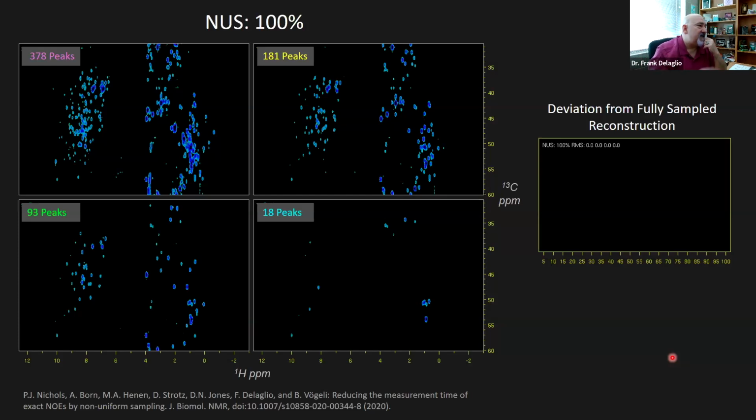However, something that's critical to consider is the nature of the data. So whatever kind of non-uniform sampling schedule you assemble, it has to have two properties. It has to capture enough signal to get above whatever noise there is, and it has to have enough samples to describe all of the signals in the data. So in other words, the effectiveness of non-uniform sampling depends on the number of signals in the data, and as we'll see, it also depends on how they are distributed.